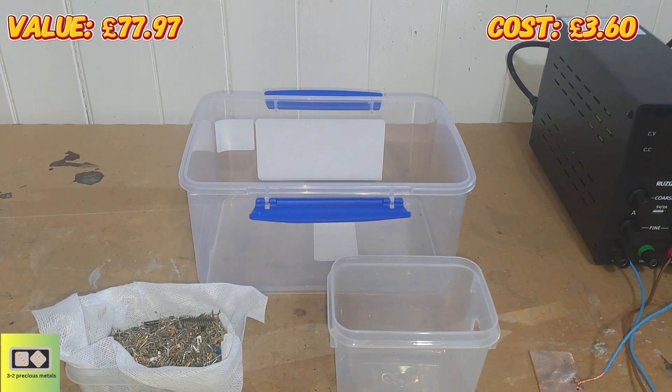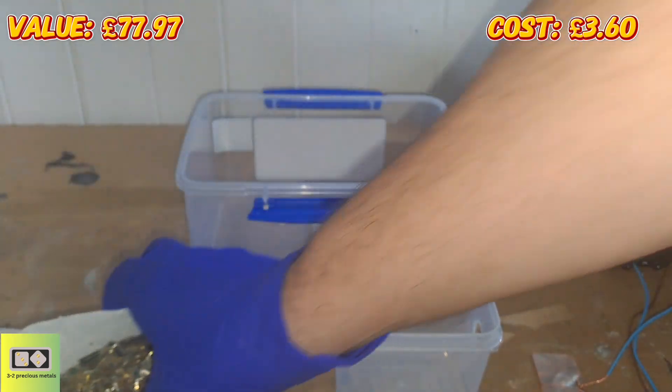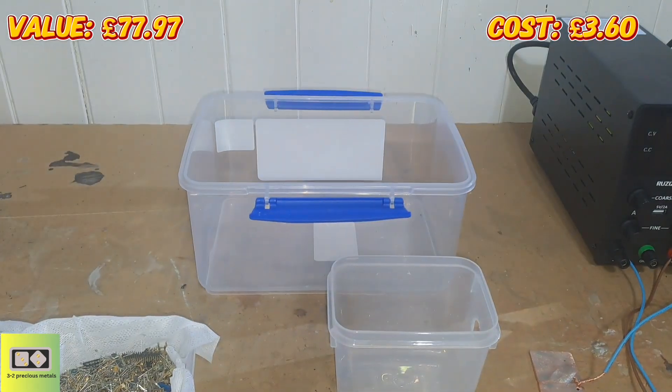Welcome to part two of the recovery of precious metals from 20 kilograms of e-waste. From part one, I had these pins that I tried to leach the gold from — I struggled with the magnet with the non-magnetic pins and it didn't want to leach. I was going to dump everything in a vat of nitric acid, but that's going to take a lot of nitric and become expensive. So I thought to make a little copper cell and see if I can dissolve the copper first.